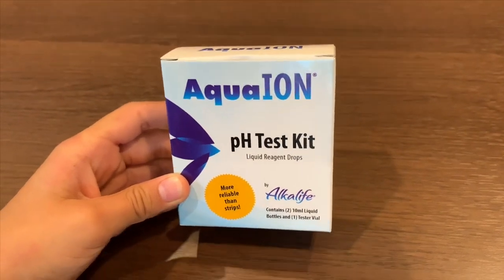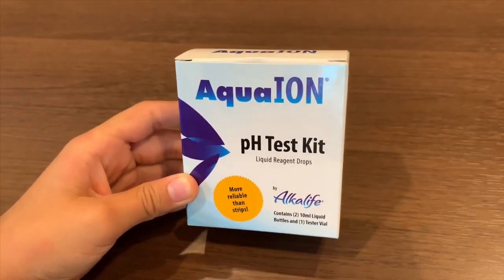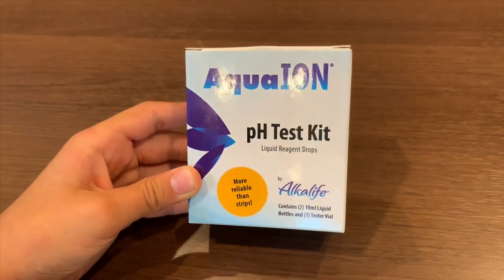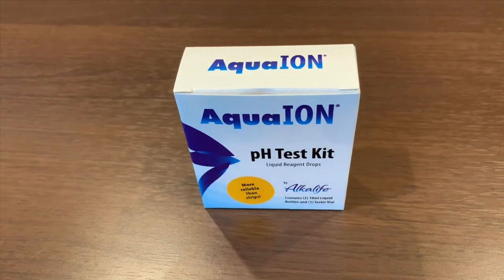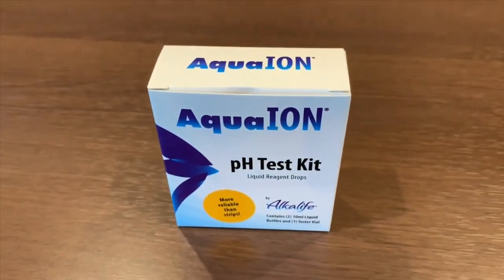This is the Aquione pH test kit. Today we're going to use it to see what the pH level of the waters are. For more information, check the link inside the description.